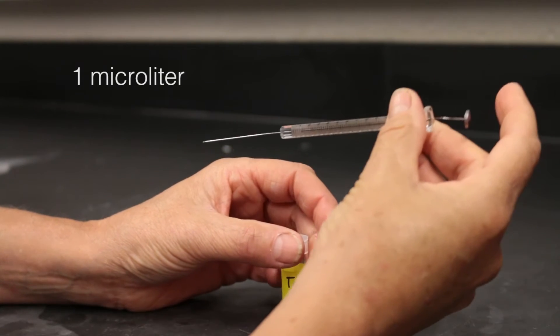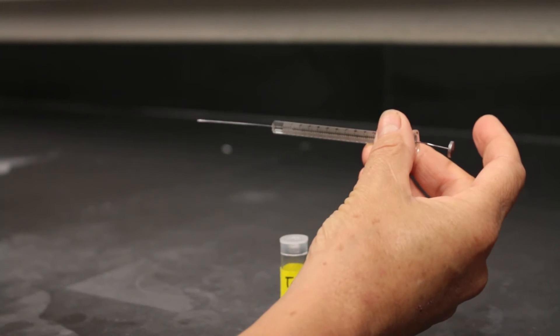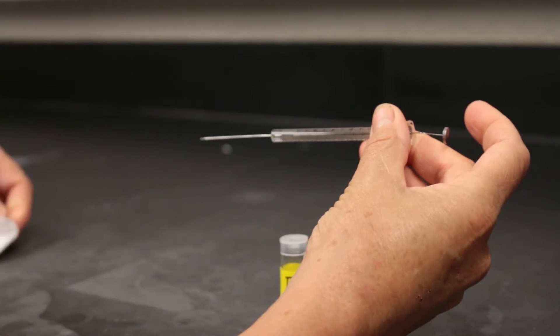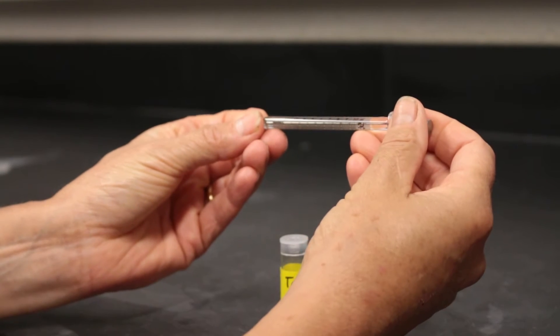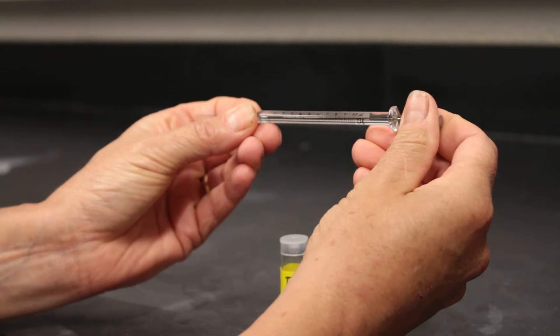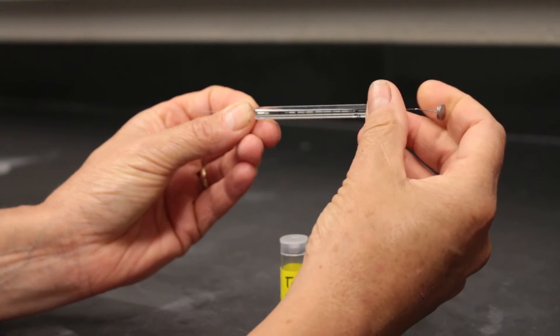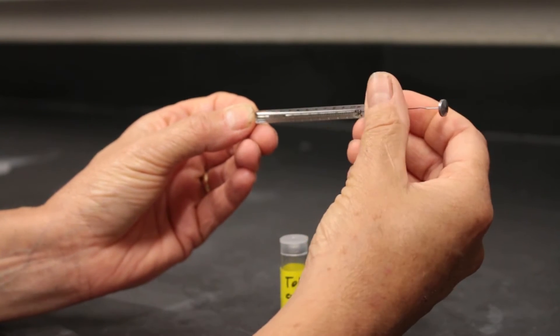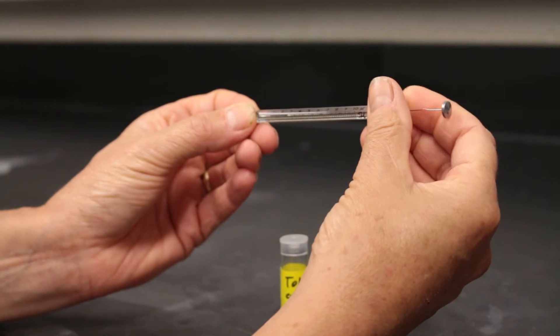Remove your syringe from the sample. Wipe the needle with a kim wipe. You can verify your sample in the syringe by pulling up the plunger until you see an air bubble after your sample. Now you're ready for the injection.